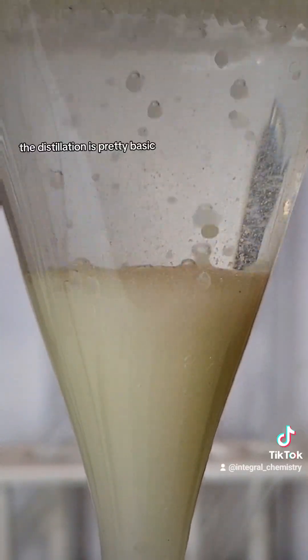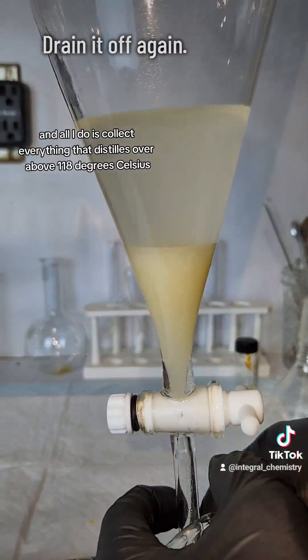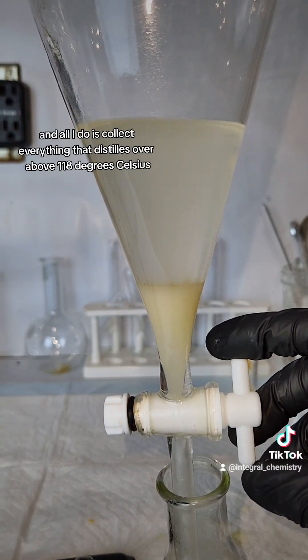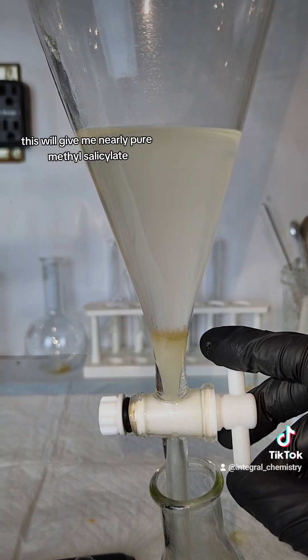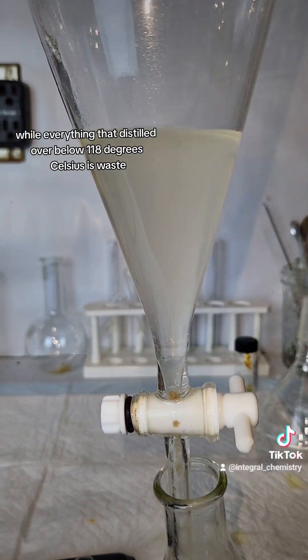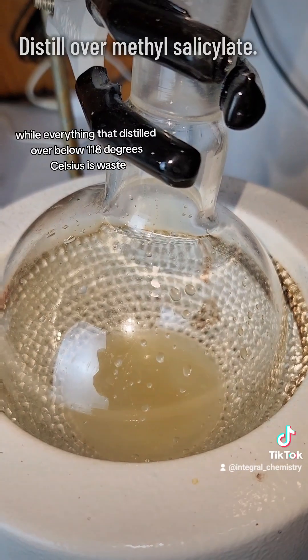It's time for a distillation. The distillation is pretty basic, and all I do is collect everything that distills over above 118 degrees Celsius. This will give me nearly pure methyl salicylate, while everything that distilled over below 118 degrees Celsius is waste and can be discarded.